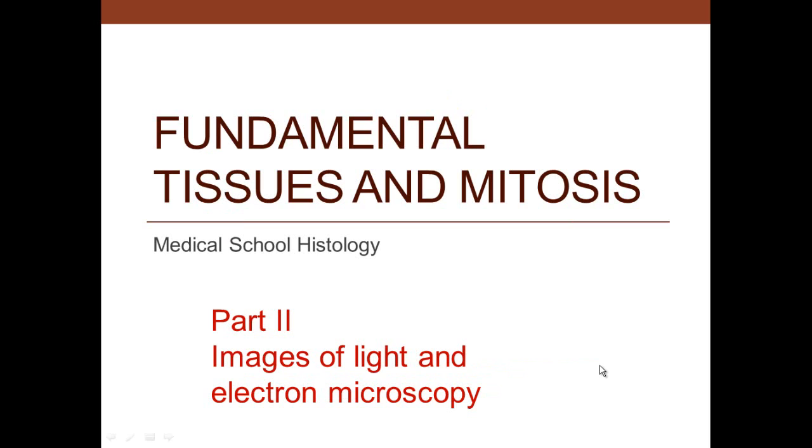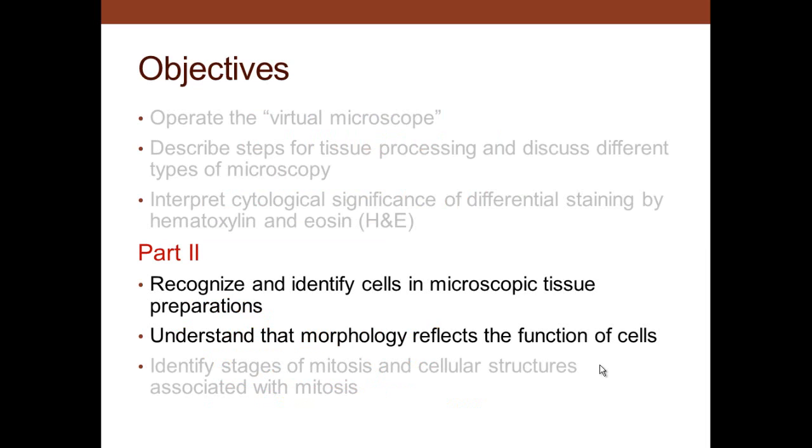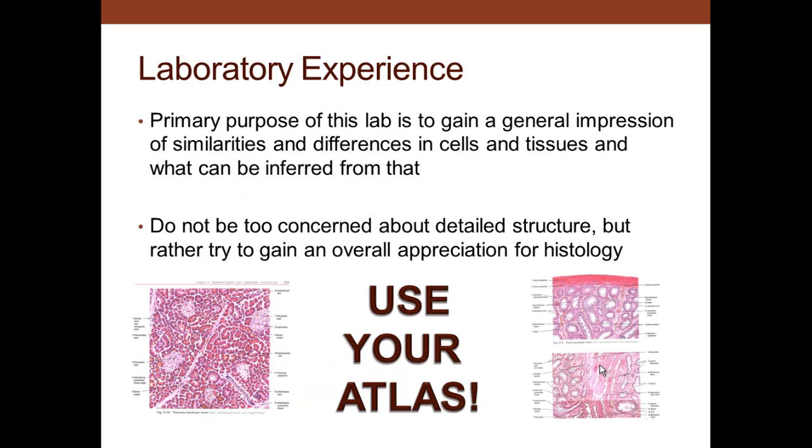Fundamental tissues and mitosis. This is part 2. We'll be talking about the images of light and electron microscopy. So we want to recognize, identify cells in microscopic tissue preparations and to understand that morphology reflects the functions of cells is what we want to talk about.